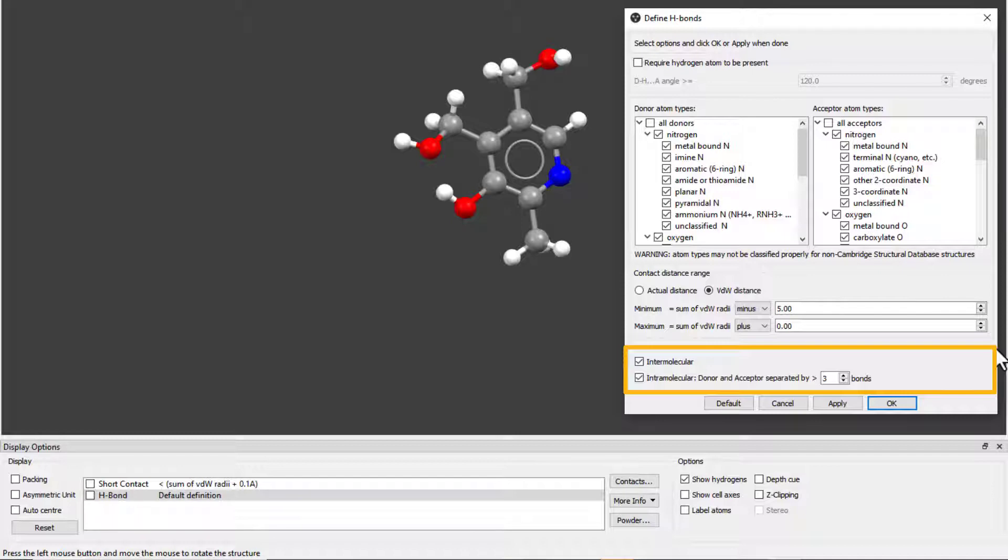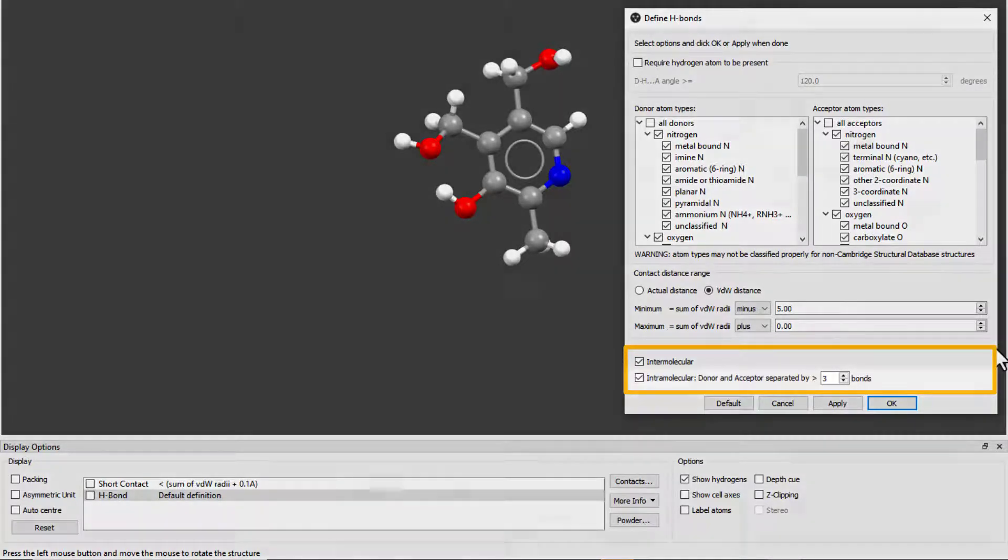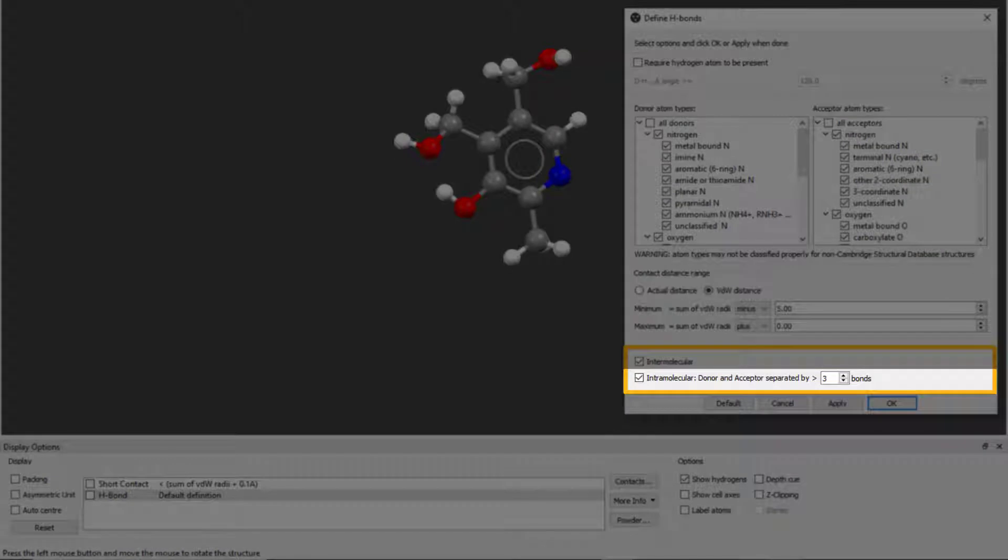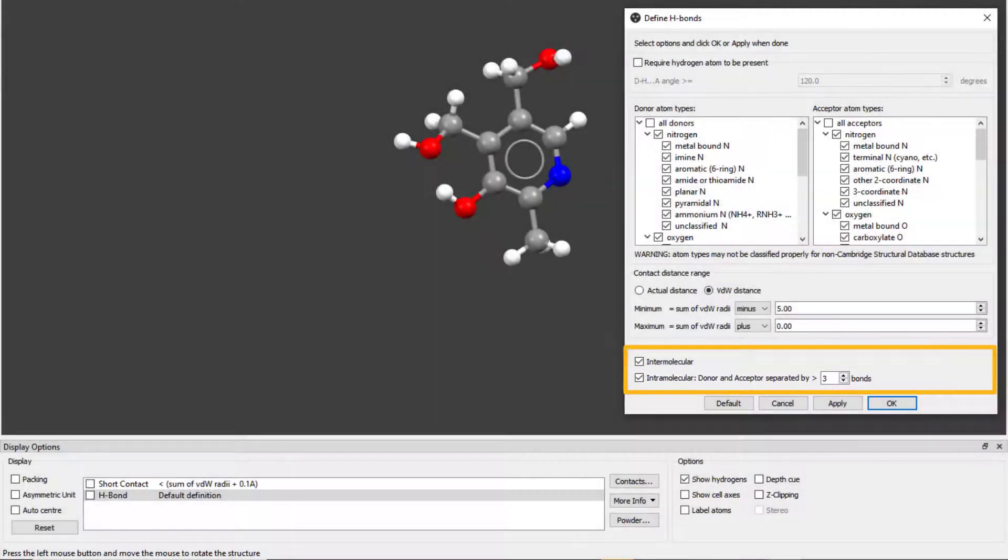For intramolecular contacts, we see in this case that we want donor and acceptor atoms separated by at least three covalent bonds within the molecule.